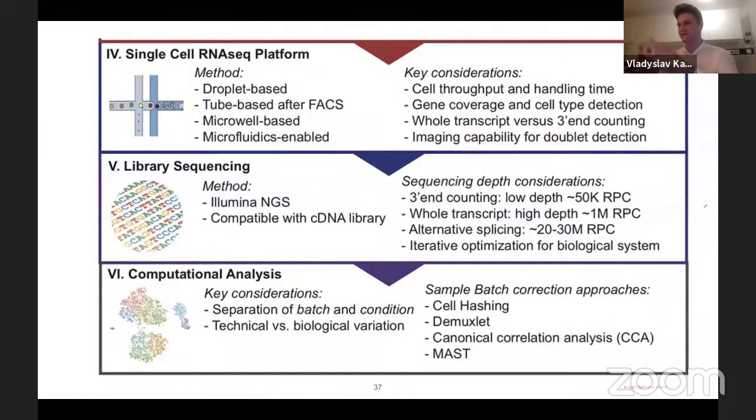something from another field. Step 5 requires a sequencer machine that can sequence your DNA library to give you the information about the bases in your DNA library. So step 4 is something you usually do in your lab, and the final target is to reach the DNA library. And step 5 is something you send to a center that has a very, very expensive machine for sequencing. They sequence this DNA for you, and then you get an output as a list of the bases in your sample. Mm-hmm. Well said.